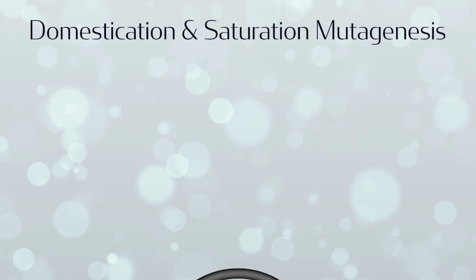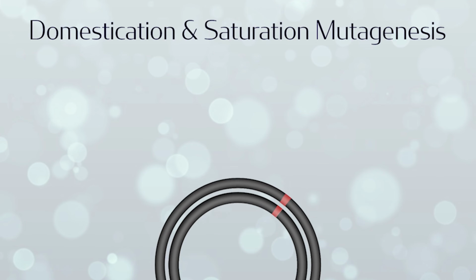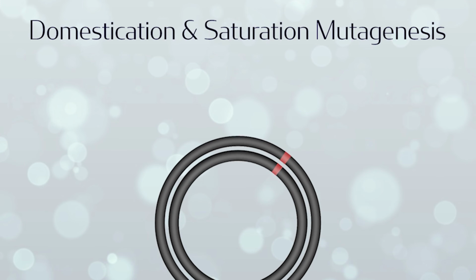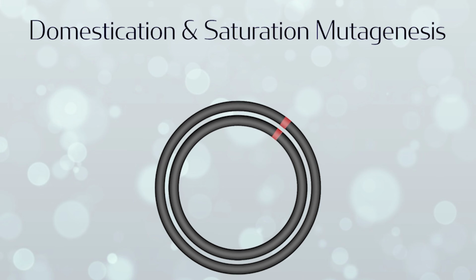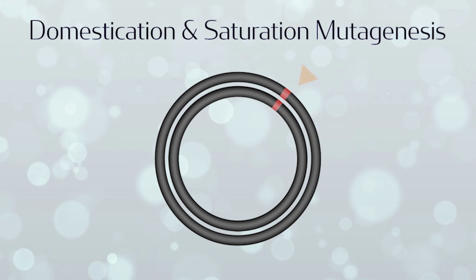Finally, oligo stitching can be used for the removal of restriction enzyme sites, which is needed for part domestication. Another application is saturation mutagenesis. In this application, we start with the desired part containing a restriction enzyme recognition site that needs to be domesticated, or a region close to a restriction enzyme site that is to be mutagenized.